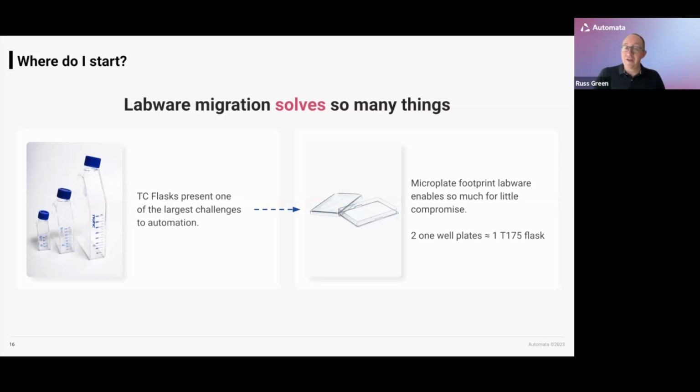We might do, and again, it comes back to our goals, because it might be that we have a particular throughput constraint and we're making this worse by having more pieces of labware, but more often than not, that isn't the core problem here. And so actually, I think migration to new labware, yes, it does require some revalidation and retesting for a lot of people, but it tends to be the better way forward, because it unlocks so many of the other things I'm about to talk about.